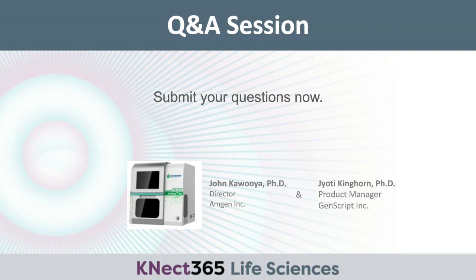Great. Thank you, John. Another question we have. Thank you for your presentation. The device looks good. Do you have an idea on elution volume? Yes. So in our device currently, we recommend a minimum of 2 ml elution volume. You can go as low as 1 ml depending on the starting volume of magnetic beads.